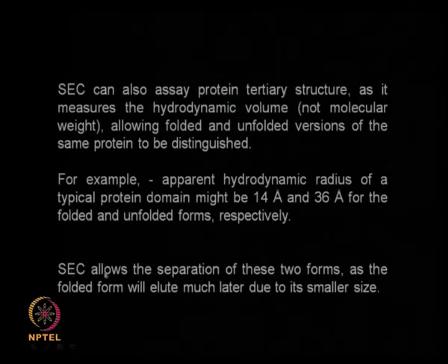It can also help separation of two forms. The folded form will elute much later because it is of smaller size, whereas the unfolded form is of larger size, so it will come out faster.